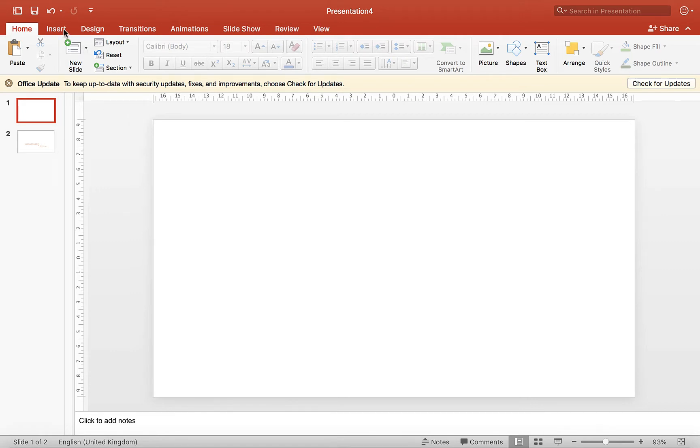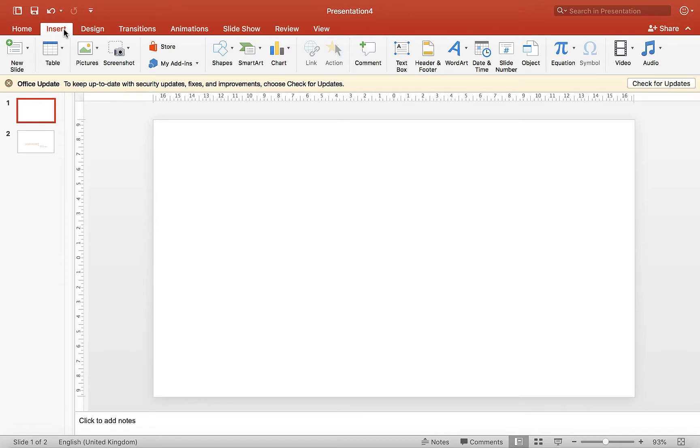So the first thing we're going to do, I'm working in PowerPoint, you can do it in Google Slides as well, I'm just doing this one in PowerPoint.